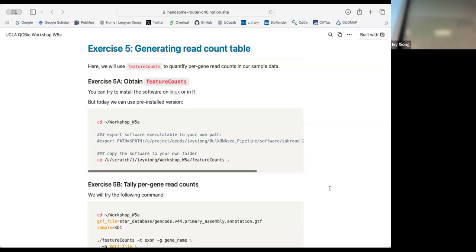Oh, I hashed that out, so you can do one. Okay, so it's just copying that. Can you go back here? Yeah, I hashed it out, so you can see more like that. Oh, okay. So those are two options, right? So it's with more for like well. But for today, we just have that software. Okay, got it. Cool, thank you.